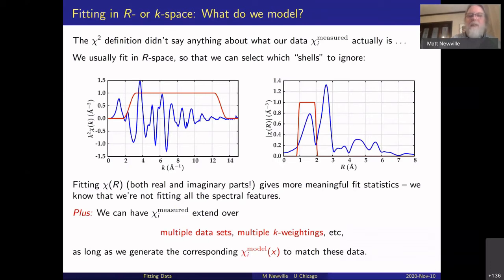I'm not showing it here, but you can also fit with Larch in not just R space, but in wavelet space, with a Cauchy wavelet that maps both k and R space. And then you can pick a finite range from those two spaces.